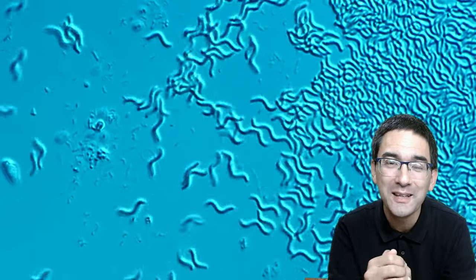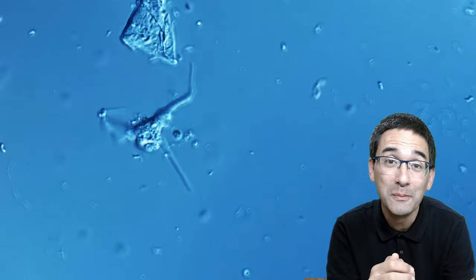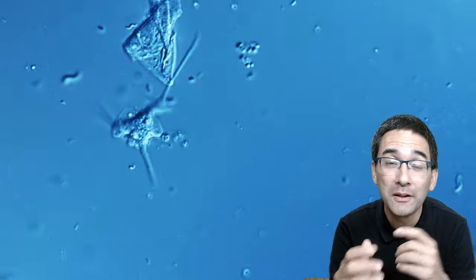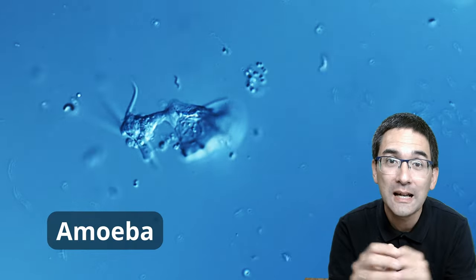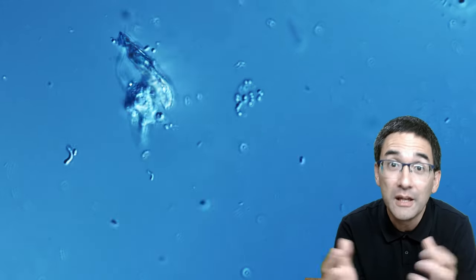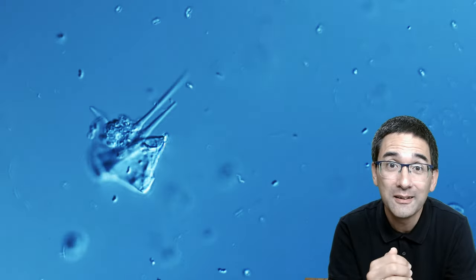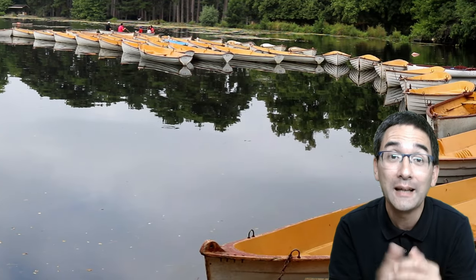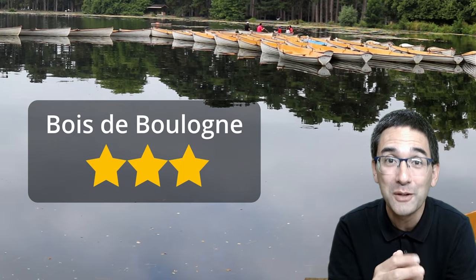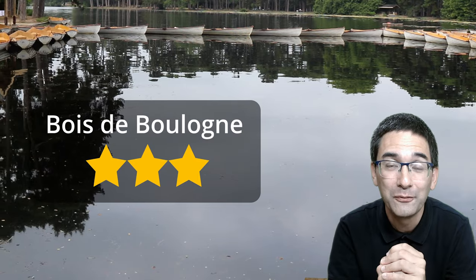I like the corkscrew way that these spirilla move around. After a few minutes of observation I was also able to find an amoeba. This is time-lapse and it shows how the amoeba is trying to engulf a large piece of debris, but it was not successful. As for the location, it's a very beautiful place that I can highly recommend — I'll give it three stars out of three because of all the variety of life I was able to find, even though the sample had already started to turn bad.